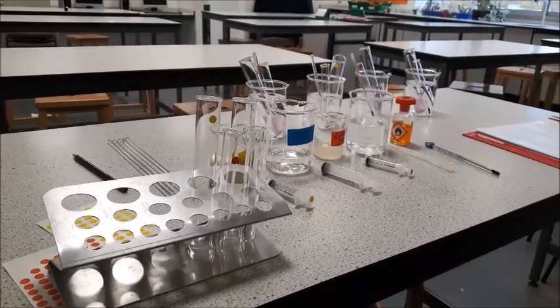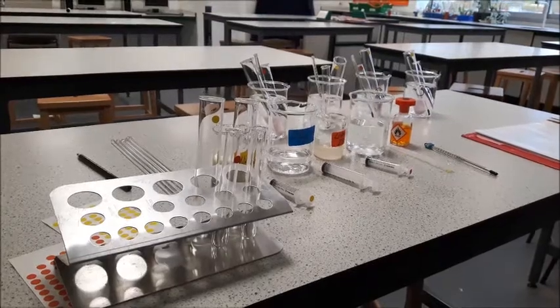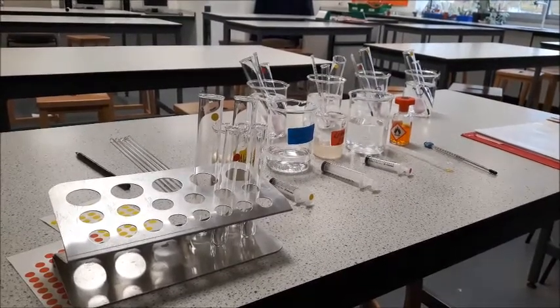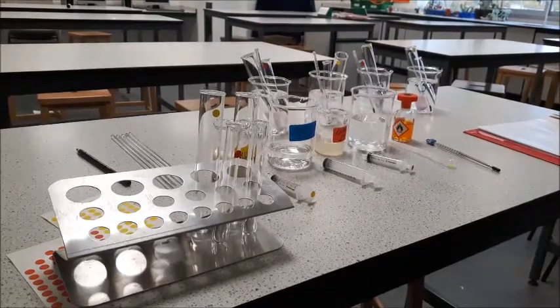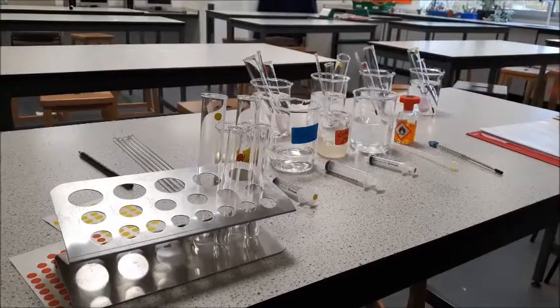Welcome to this practical video, which is required practical 10 for biology, investigating the effect of temperature on the rate of decay. I'm going to start off by showing you how to set up the experiment, and then we've got in the background some that we set up earlier, which we're going to use because they've already temperature acclimatised.